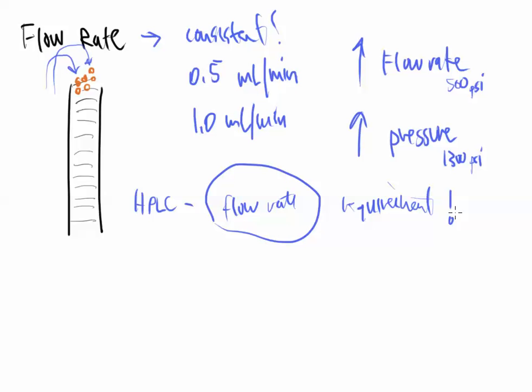So when you're in the laboratory and you're working with this equipment, there are certain things that you want to write down, and this is one of them for HPLC. You want to write down the flow rates that you are using the system on. So that is a requirement. That's something very special. You need to put that in a laboratory book. You need to put that into a laboratory report when you submit your data to someone. Very, very important value. And this can change depending on the user, depending on the method, and depending on what you're separating. So flow rate, extremely important.